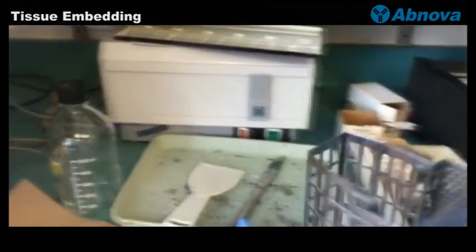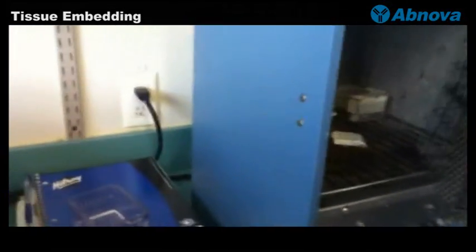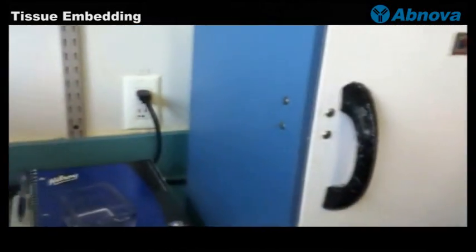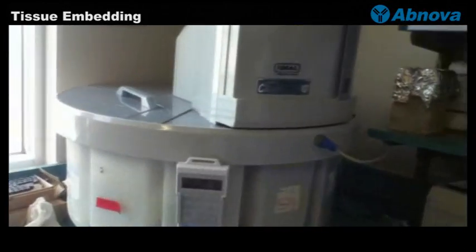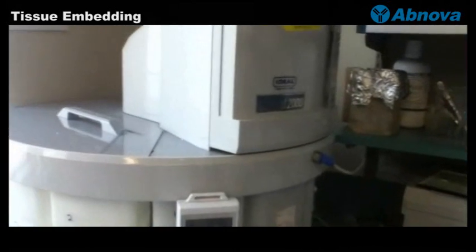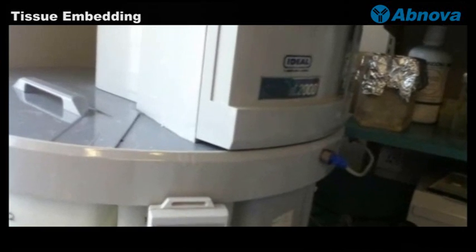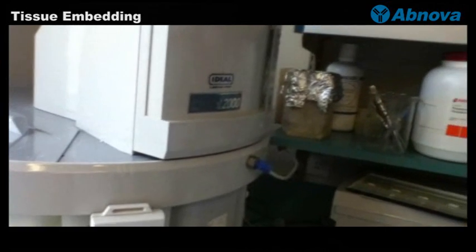We can put all this into a heated oven to make sure everything keeps warm. And this processing machine just helps us to dehydrate and do the clearing process for the tissue before it is infiltrated with the paraffin.